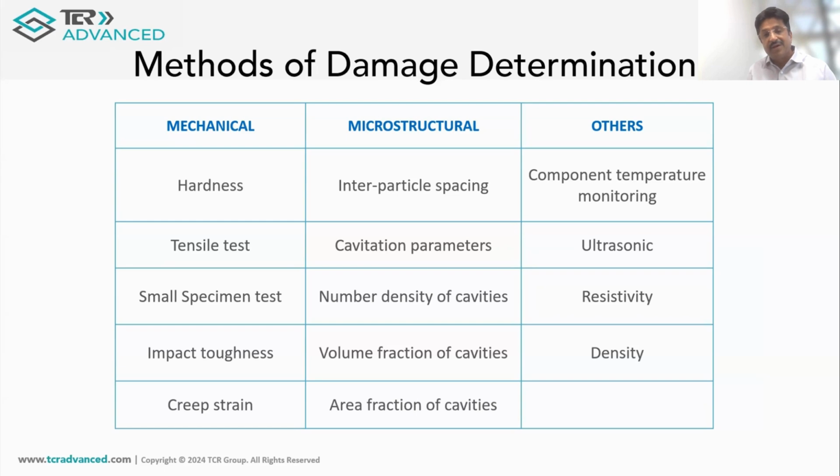If you see a lot of people, those who are trying to do in-situ metallography, when the report comes to me for review, most of the time they only try to put the remarks which are written in the standards or handbook. But one can get much more information and detail for the plant assessments if they are involved in understanding the damage mechanism, and hence a replication technique has to be done by the person or the company who has the experience in damage mechanism.